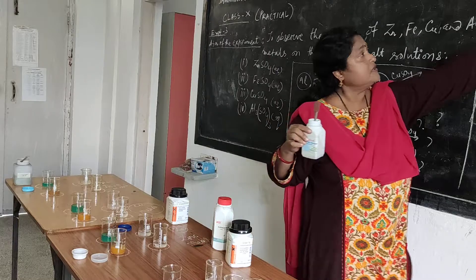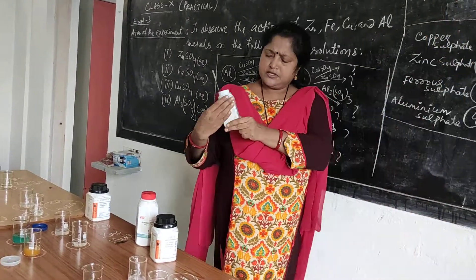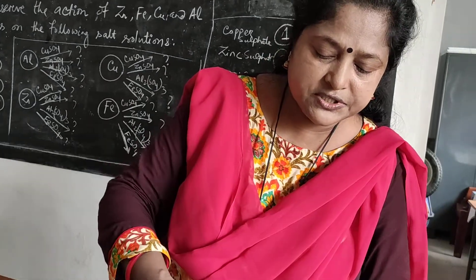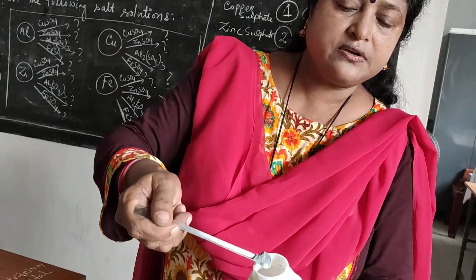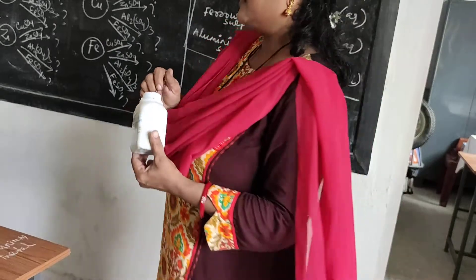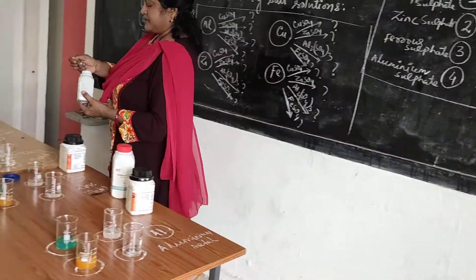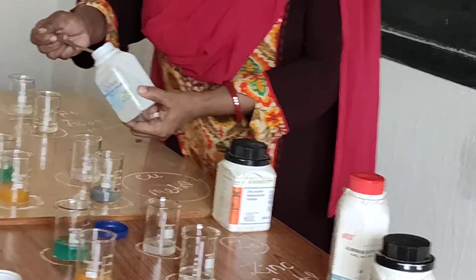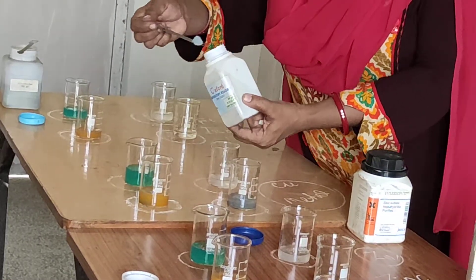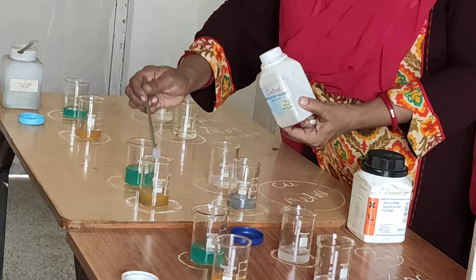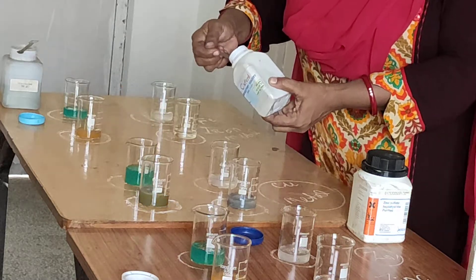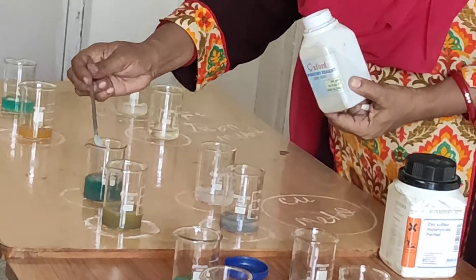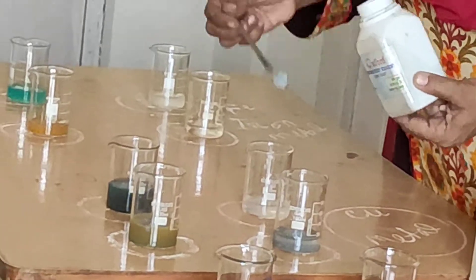The third table is your zinc. This is your zinc dust. I am adding zinc dust to all four beakers: 1, 2, 3, and 4.